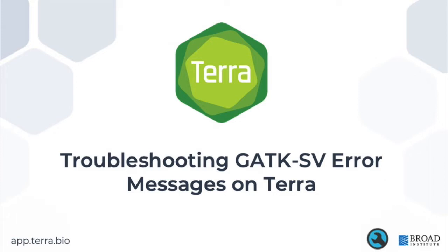In this video, I'll show you how to troubleshoot errors with GATK-SV. GATK-SV is a pipeline available in Terra to find structural variants in whole genome sequencing data. You can find articles describing an overview of the method and how to get started in the video description.